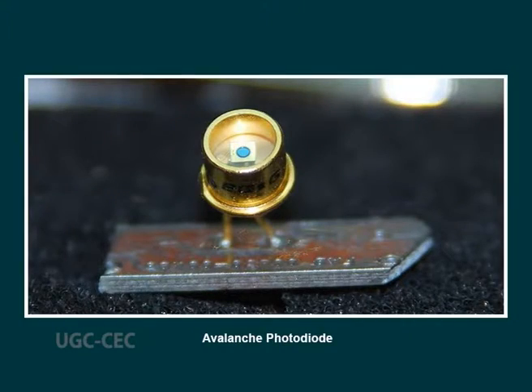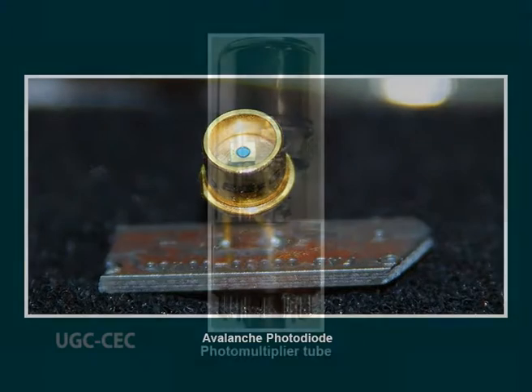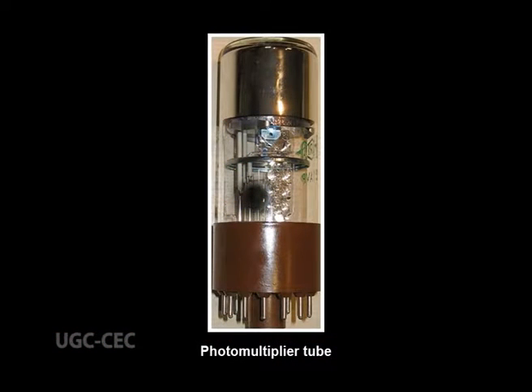The sequence can then be determined by simply noting if incorporations occur and by counting the number of incorporations in a given attempt. The amount of light emitted can be measured by an avalanche photodiode or photomultiplier tube.